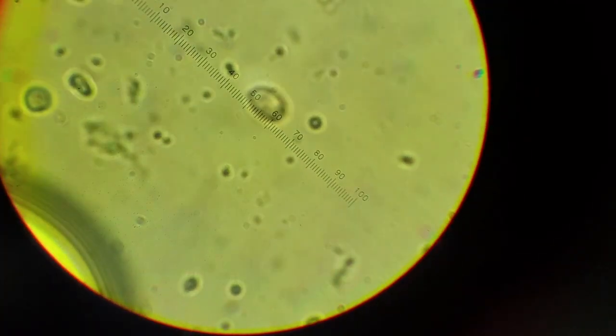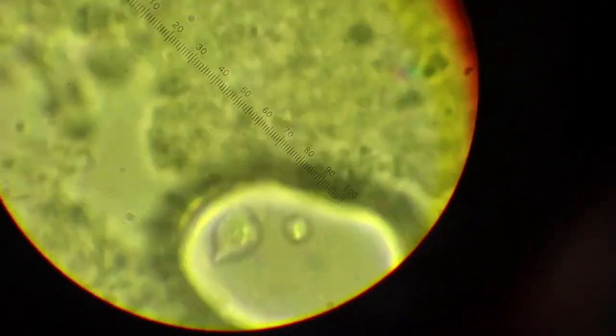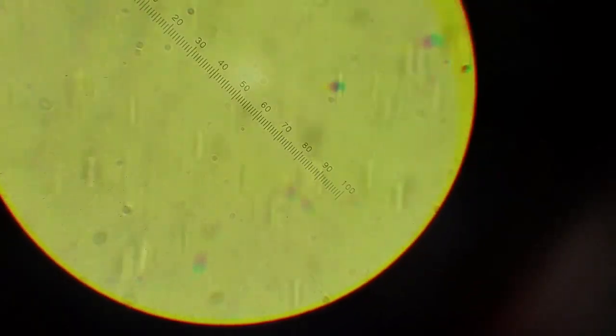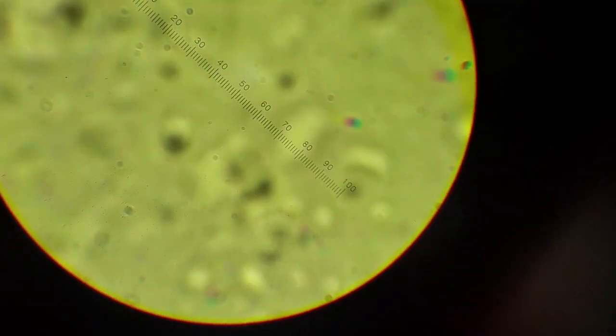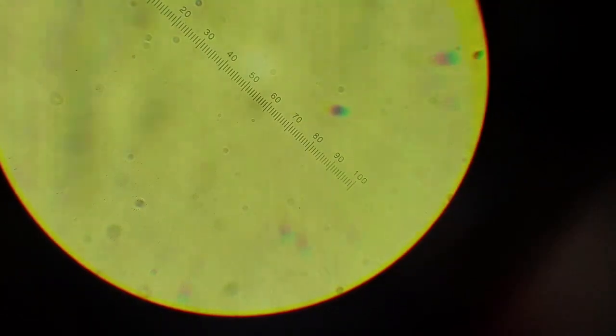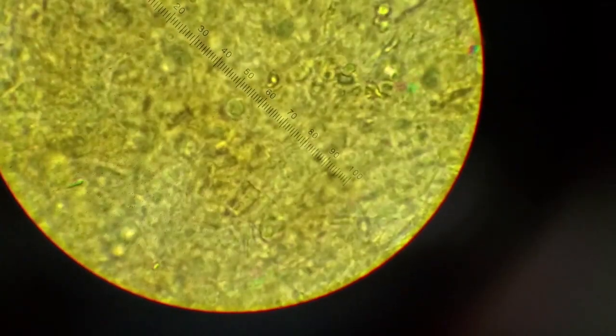And then you have your length and your width, and then you move randomly in your slide. So you're not necessarily trying to get anywhere in particular. You're just trying to see what you can find, making sure that you're not going over the same spaces that you've been before, because you don't want to repeat the count of a spore.